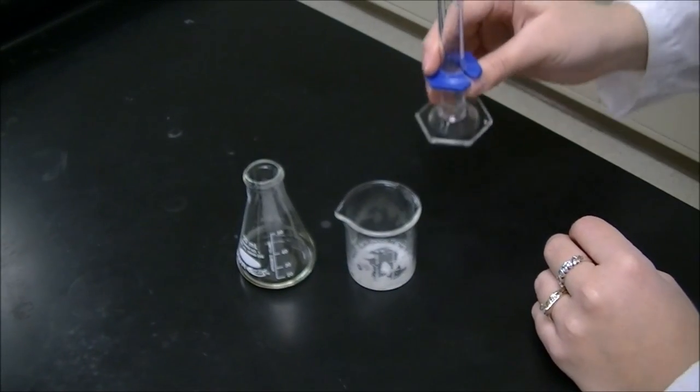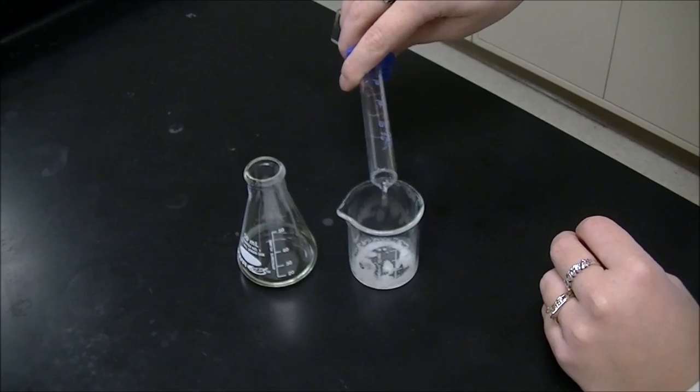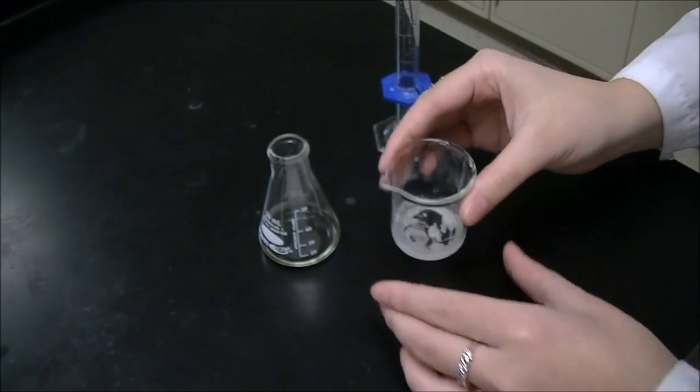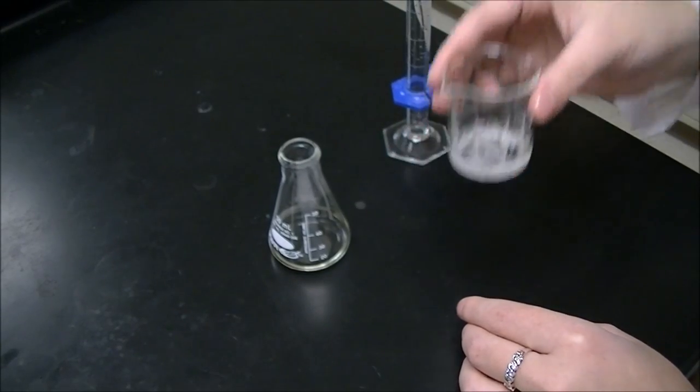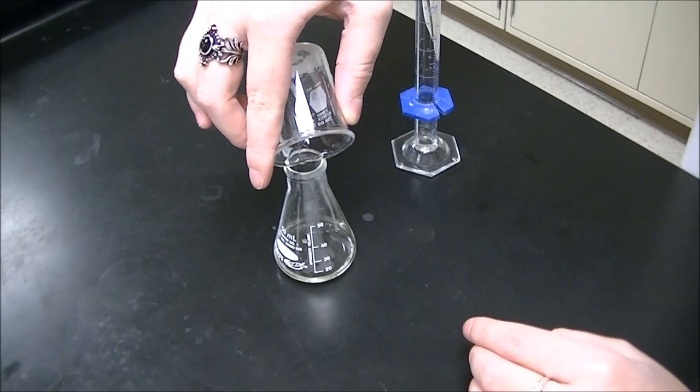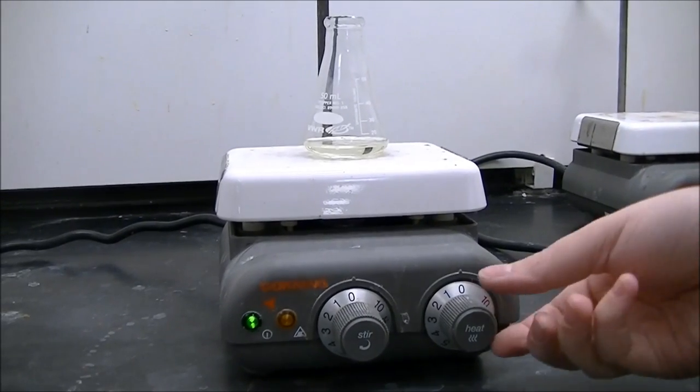Remove your organic layer into the tared Erlenmeyer flask. To make sure we've gotten all of our product, we'll wash the sodium sulfate with two milliliters of methylene chloride and add it to the flask.